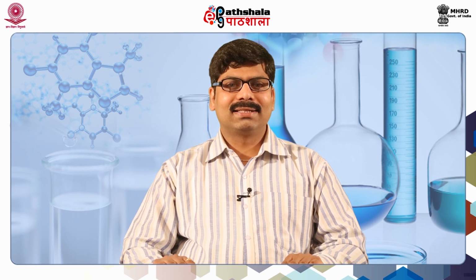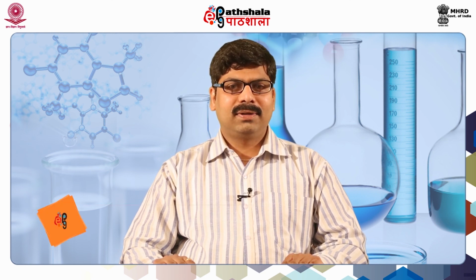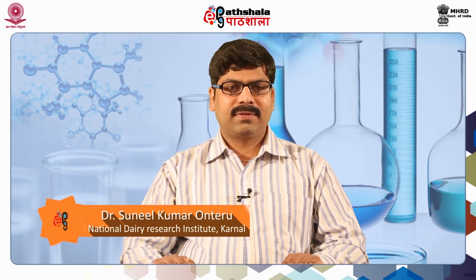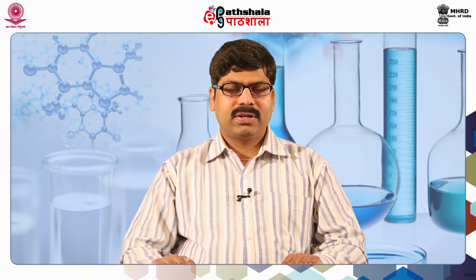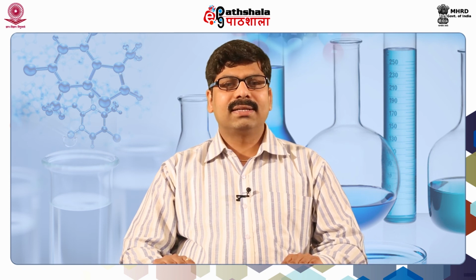Overall, in this lecture we discussed the basic concept and principle of gel filtration chromatography, the concept of exclusion limit and gel filtration chromatogram, factors affecting the gel filtration chromatogram, sample preparation and applications of gel filtration chromatography. Dear students, I hope you enjoyed this lecture.